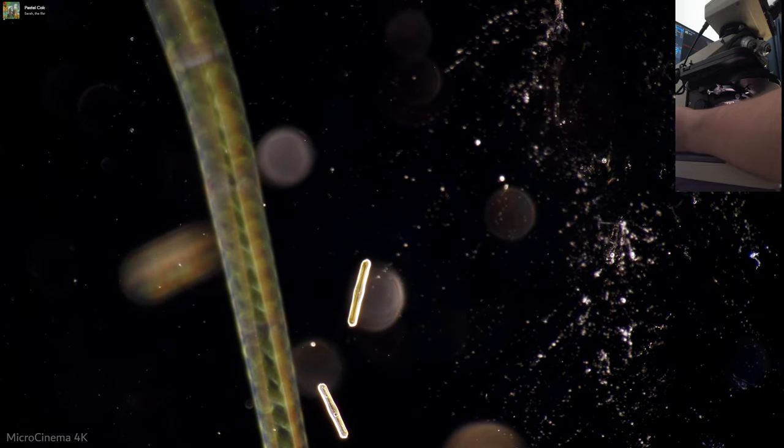We're back at Darkfield looking great, having some fun, doing some great microscopy.